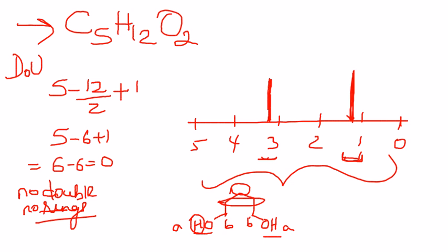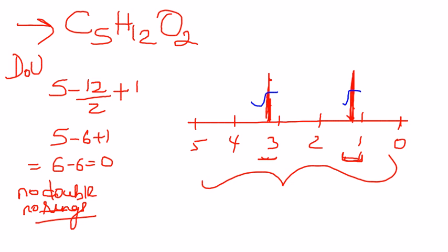So that's 4 environments. You need only 2. So this is not your possible option. Another thing that you should think about is that if it's an alcohol, that usually shows up as a broad peak on your NMR, and I don't see any broad peak over here. Plus, the intensity is pretty similar for both of these. That means the number of hydrogen atoms that are present in each of these peaks is approximately the same.